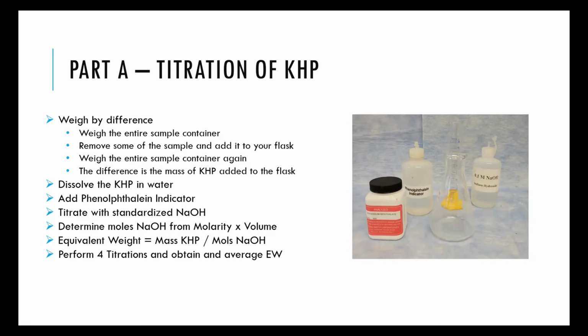This solution is available in lab, and it has been meticulously standardized. That is, the concentration is very precisely known. The concentration of that sodium hydroxide solution is known to 4 significant figures. So you should be determining the equivalent weight all the way out to 4 significant figures and performing all calculations to at least that level of precision.